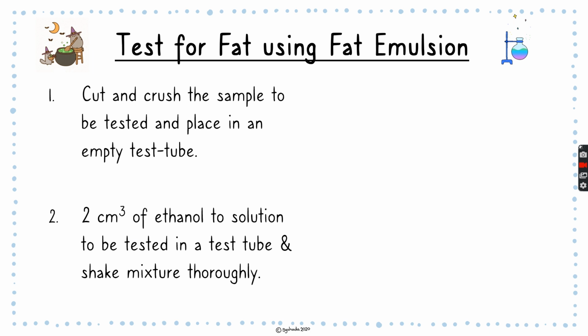Why ethanol? This is because fat, or aka lipids, that's the same thing. We mainly use lipids, but sometimes we use fat. Both of those nutrients, those biochemicals, dissolve in ethanol, so alcohol instead of water. So what you need to do is get your white towel. Usually you'll be given peanuts. Peanuts for protein? No, actually, yeah, peanuts for the fat test.